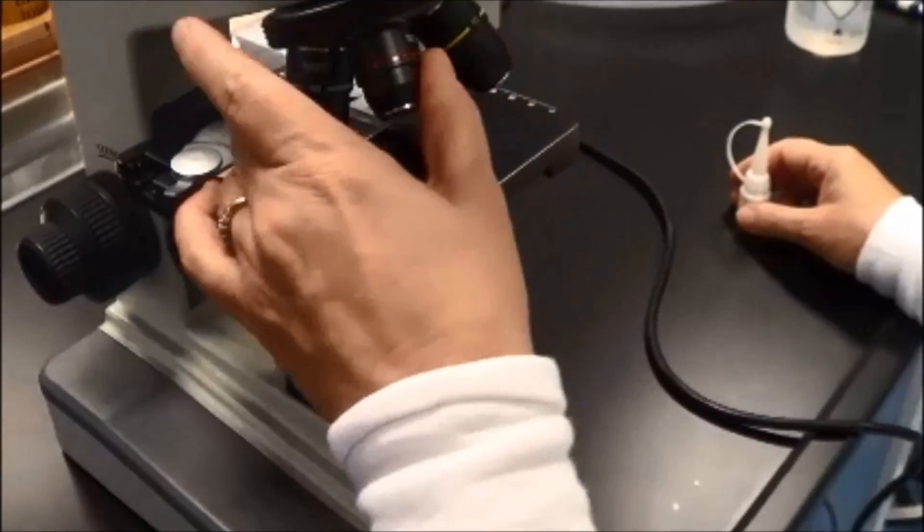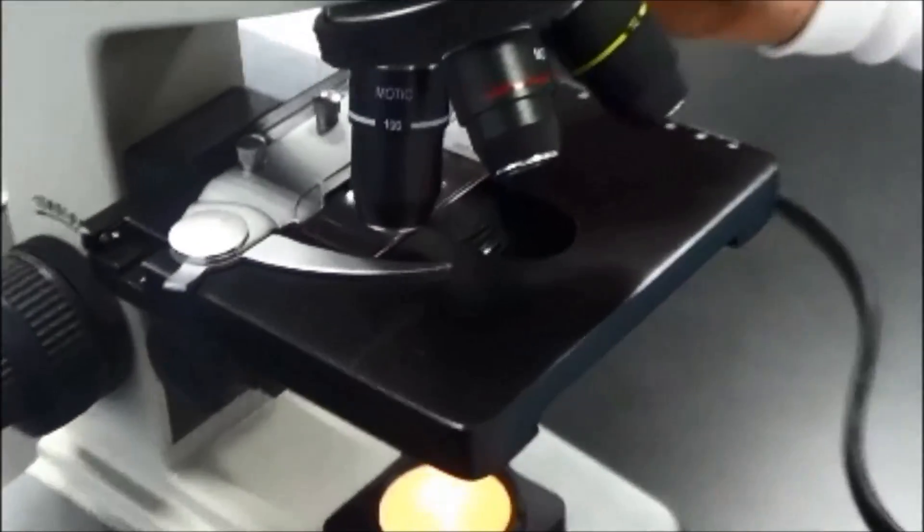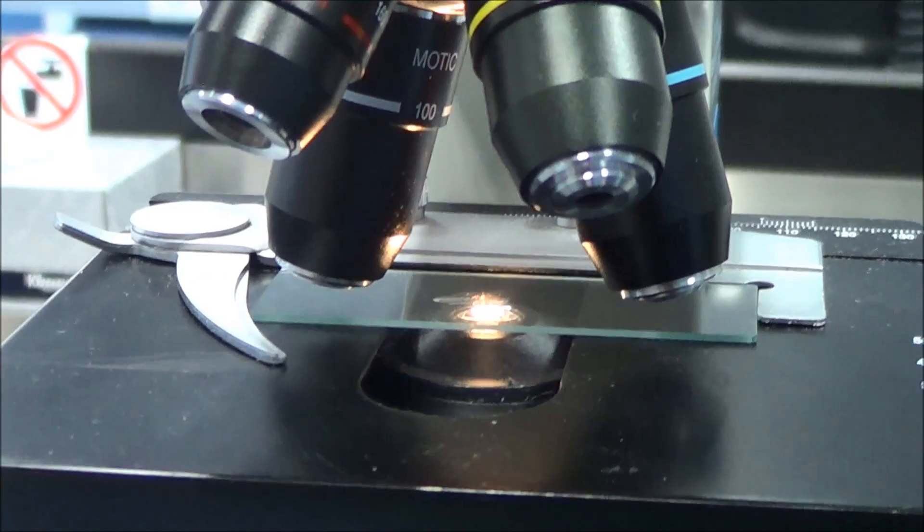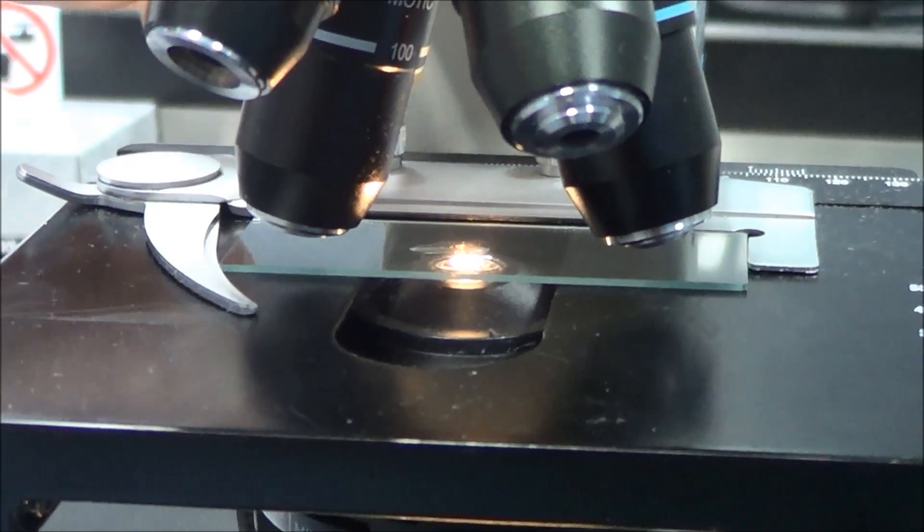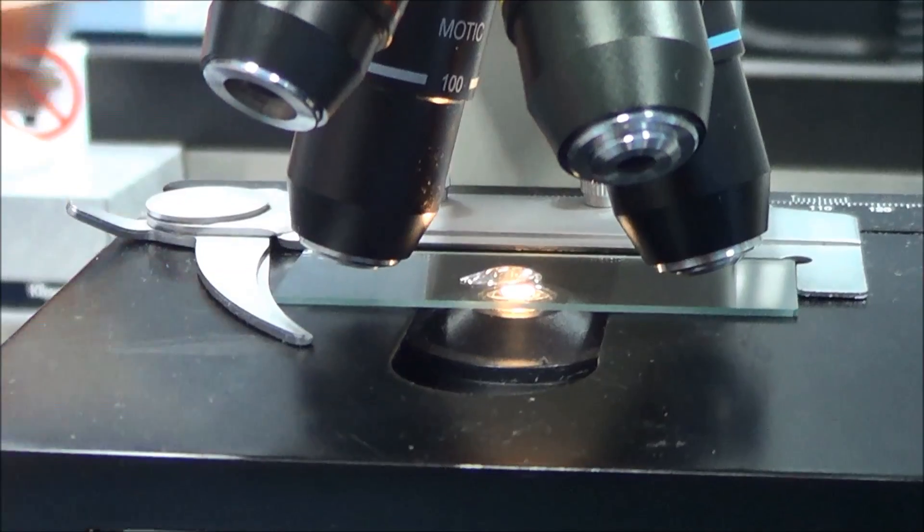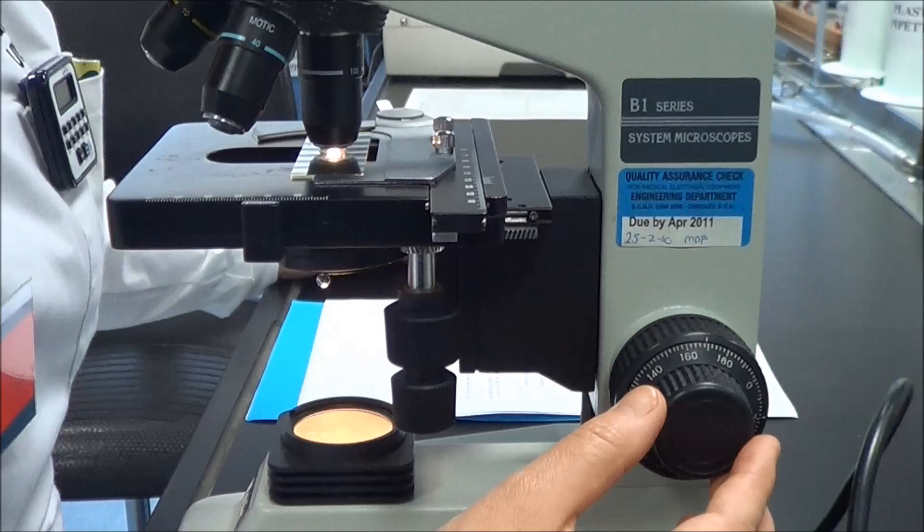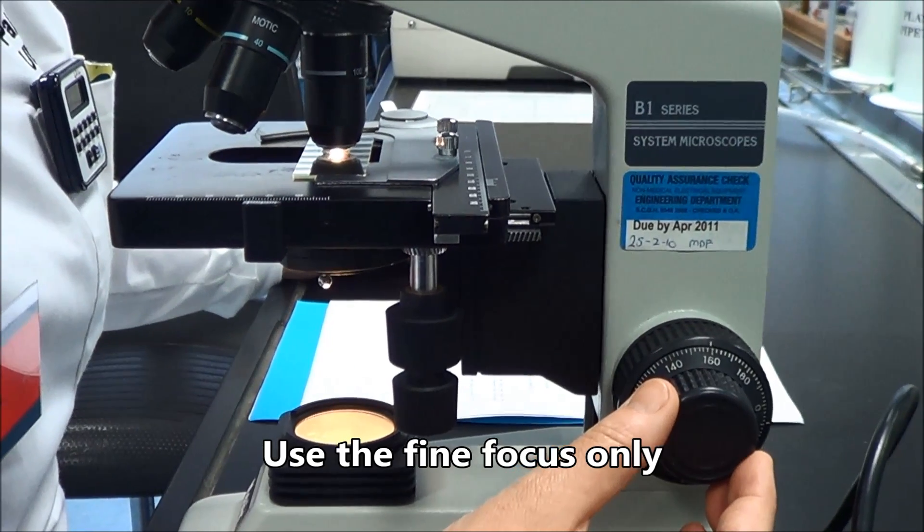To use the 100x lens, swivel the turret so that the slide is between the 40x and the 100x objectives. Place a drop of immersion oil on the circle of light on the slide and swivel the 100x lens into position so that it is in contact with the oil. Refocus using the fine focus only.